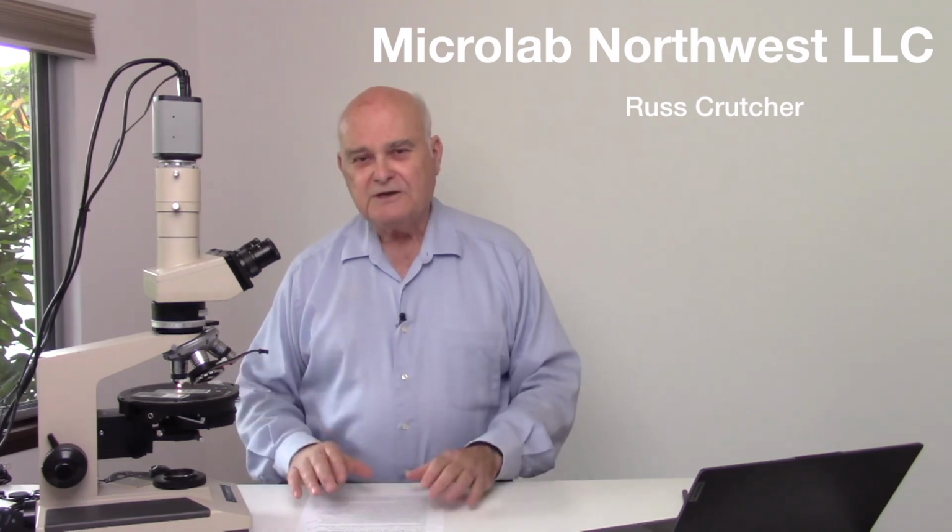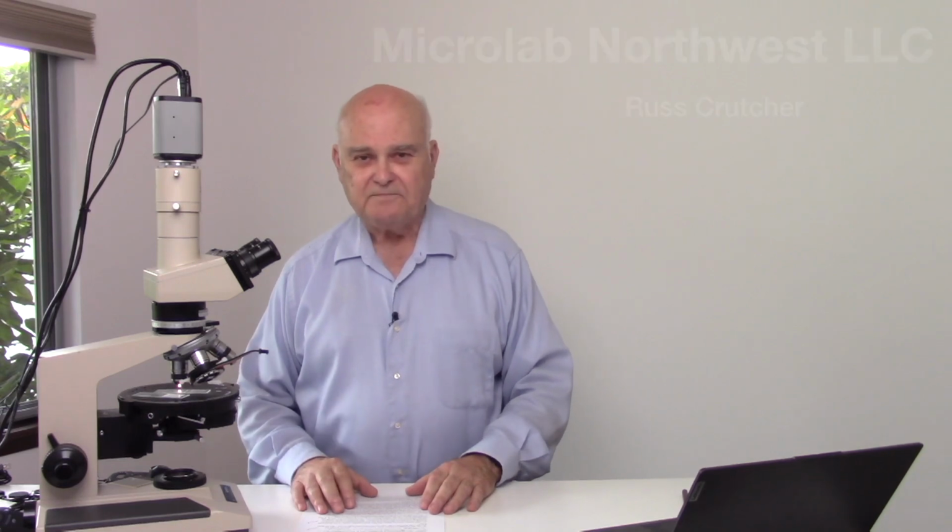The microscope is an amazing piece of equipment. But in order to use it correctly, we have to train it. Training the microscope begins with Kohler illumination. In order to get Kohler illumination, we simply have to have the optical planes in the microscope all in the right position so that we have optimal illumination on the particle and the particle is in sharp focus.